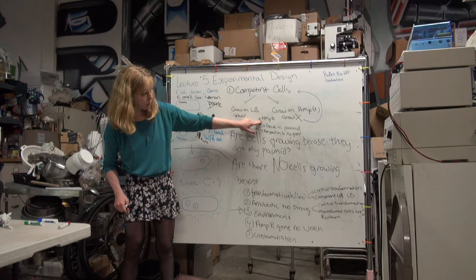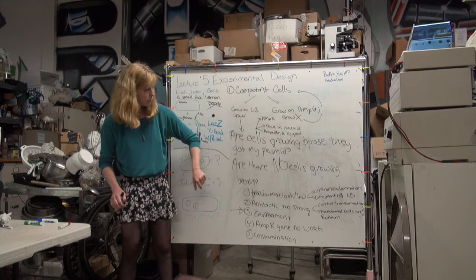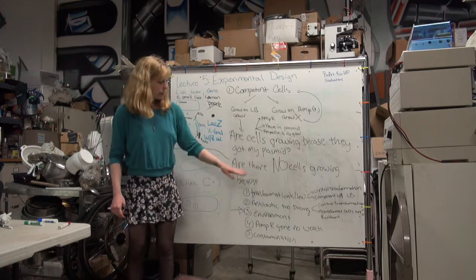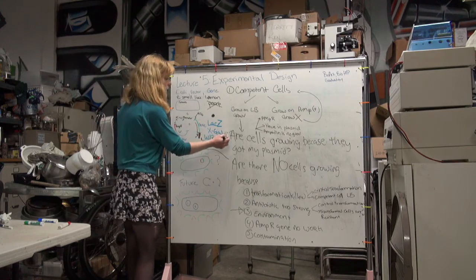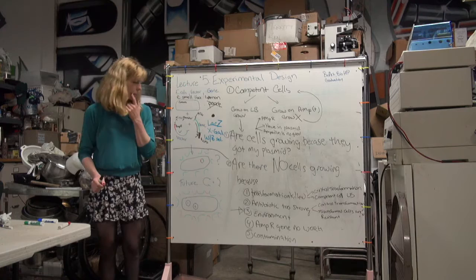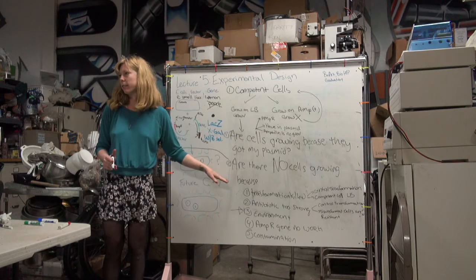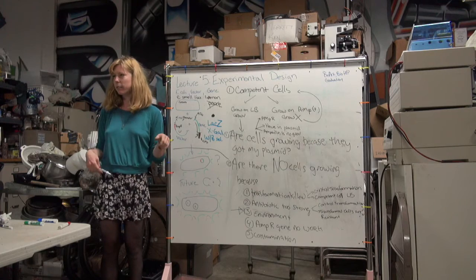So here, if AmpR's not working, then none of the cells are going to grow. But you want to have something in the cell or borrow a pre-transformed piece, right? So basically you need those plates. But you understand we're answering just 2 questions here. What I hope to happen, what I don't hope to happen, and then explanations for why I'm seeing this and why I'm seeing that. And then a physical experiment that tests what I'm seeing. Does that make it a little bit more clear?